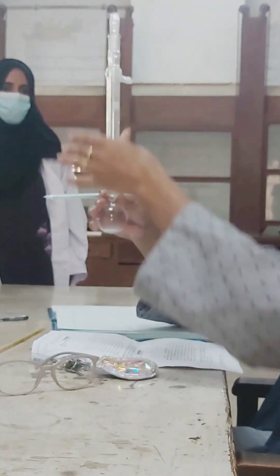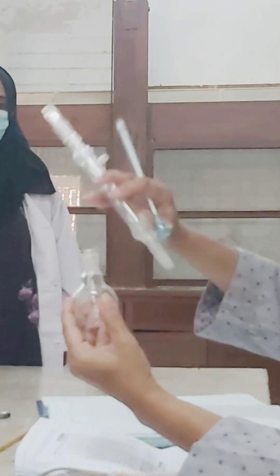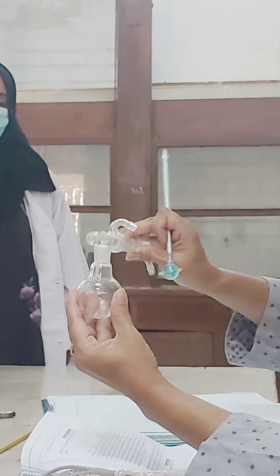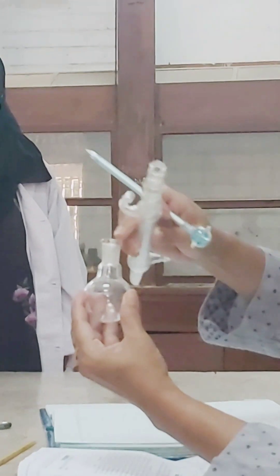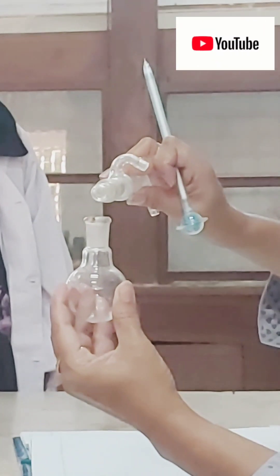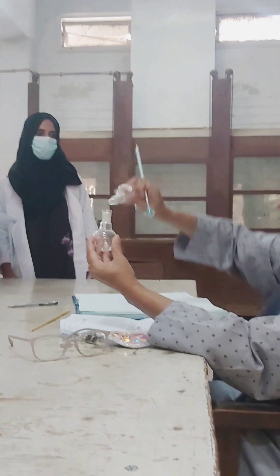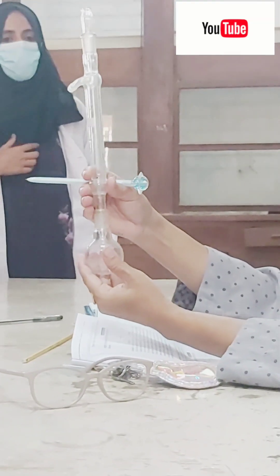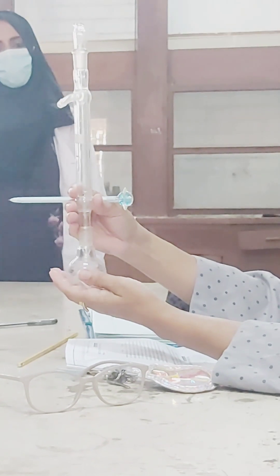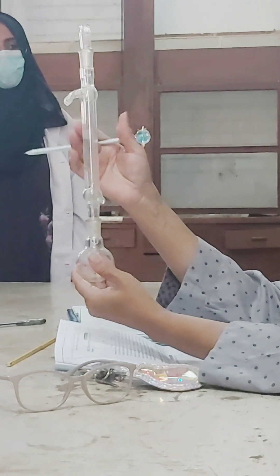When your condenser is positioned vertically upright on the flask, this is called refluxing. When it is tilted, that is called distillation — your condenser should never be straight up when you are distilling. So here we are talking about refluxing, and these are the water inlet and outlet positions on the condenser.